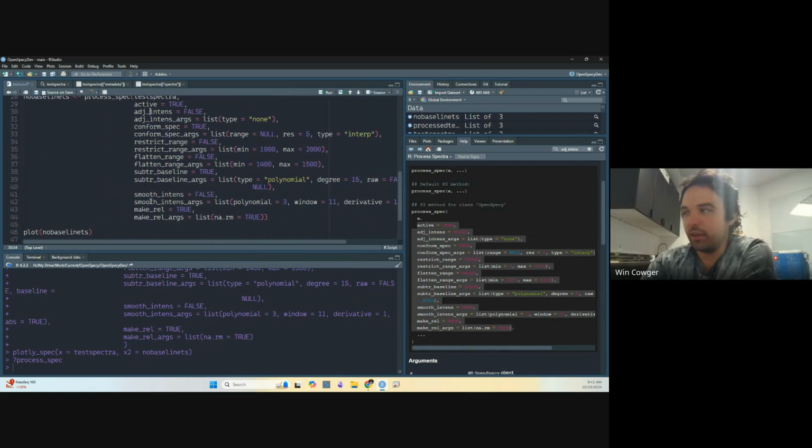There's the peer-reviewed paper that this function came from. It's called the imod polyfit function. They recommended 8, and so that's why that default has been set to 8. But a lot of times I find that the degree should be higher, and making the degree higher doesn't really have a lot of downsides, but occasionally it does have a downside.